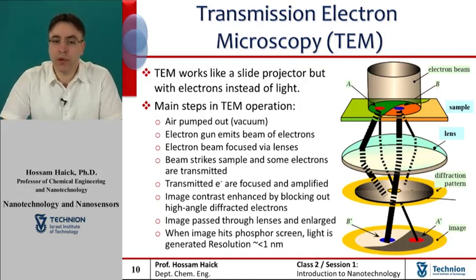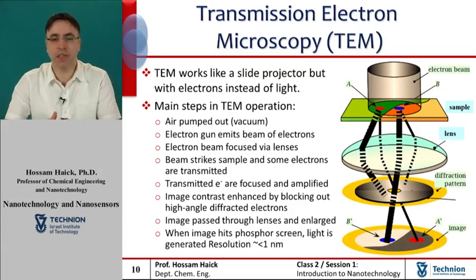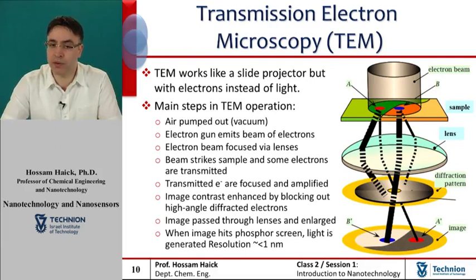There are four main components to a TEM: an optical column, or more specifically, an electron optical column, a vacuum system, the electronics, and the control software. A modern TEM typically comprises an operating console supported by a vertical column and containing the vacuum system and control panels for the operator. The microscope may be fully enclosed to reduce interference from environmental sources and operated remotely.